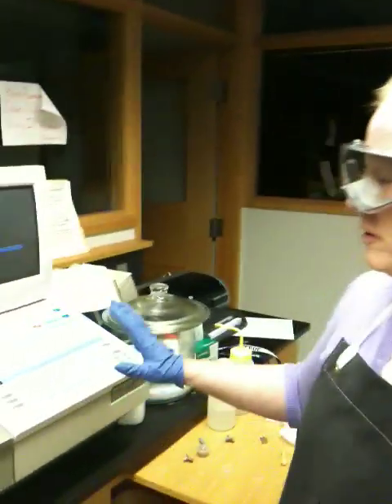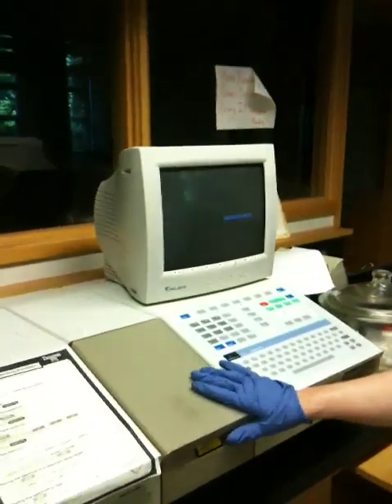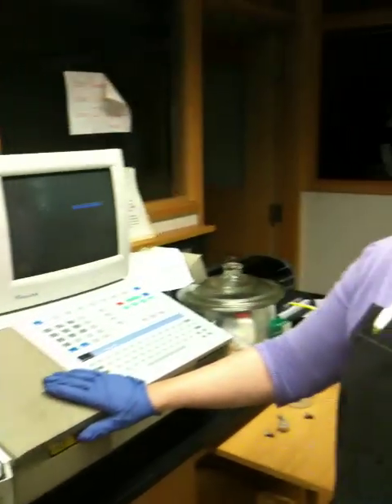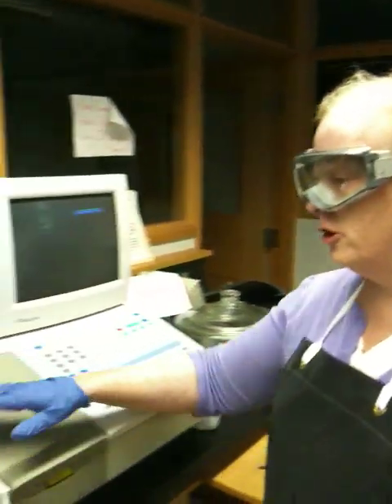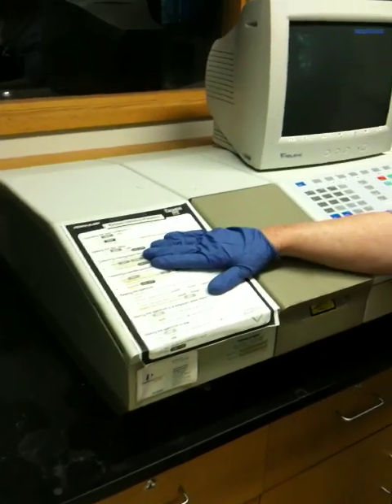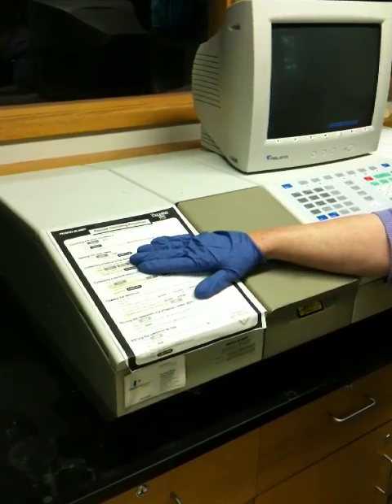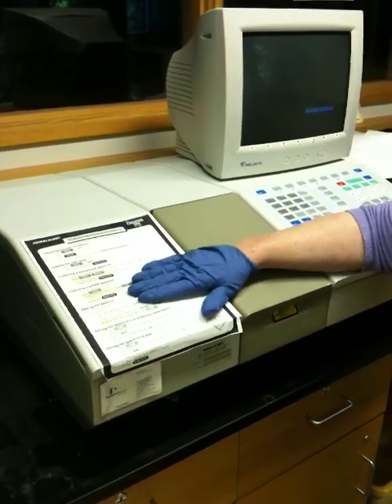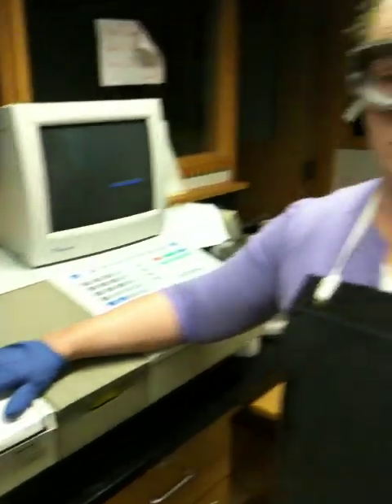The first thing I want to show you is our instrument. This is a Perkin Elmer Paragon 1000 FTIR. We have two of these. They are very good, very valuable instruments, and you will use them on a nearly weekly basis. One thing I want to alert you to right away is that the instructions for using the instrument are taped right on the instrument, but a lot of times people are not aware of this. You might want to take note of that when you come to lab. We are always willing to help, but it's good to get out a little earlier.